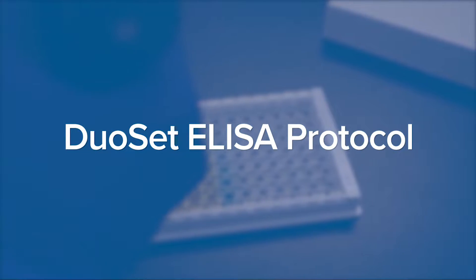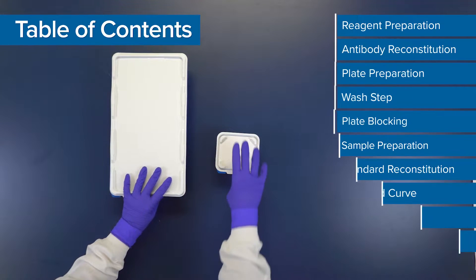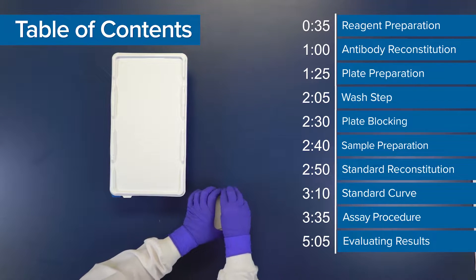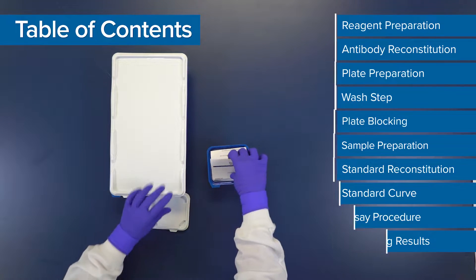This video is a general step-by-step guide to running an R&D Systems Duoset ELISA. This is a development assay which provides the components for performing sandwich ELISAs and has been validated for cell culture supernate samples.